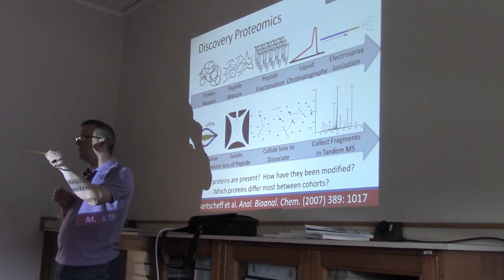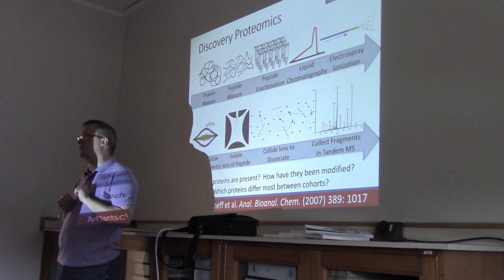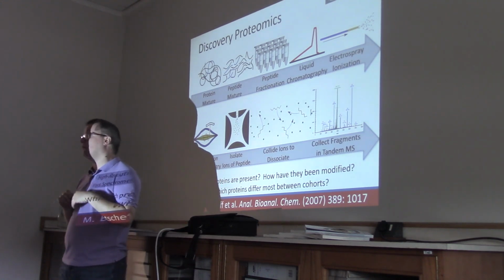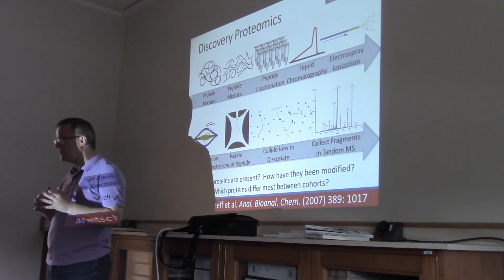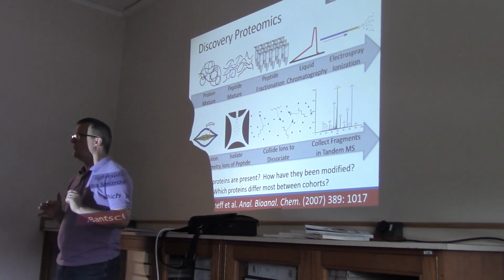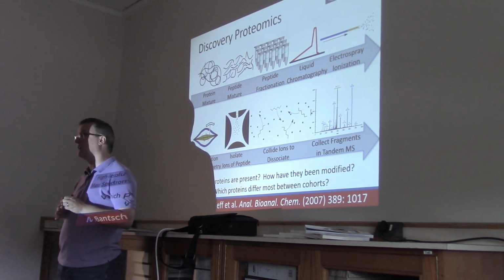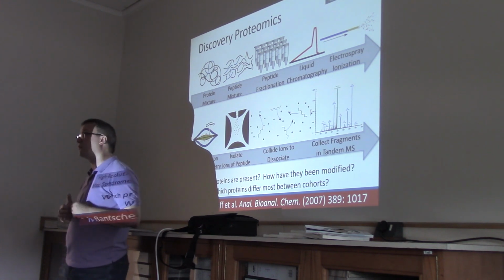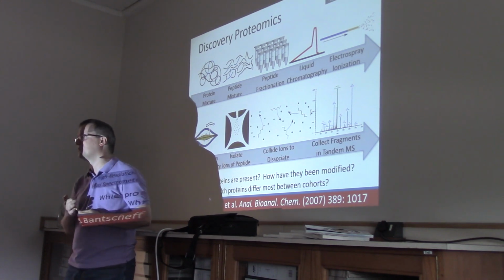Greater than. Anyone disagree? Are there some proteomic samples that would have less than 1,000 proteins? Definitely so. We often use things like co-immunoprecipitations and fire those through the mass specs. Typically, if those are relatively clean at least, they're not going to have 1,000 proteins in them. We may be shooting something very complex like a biofluid through a mass spec, and it will contain more than 1,000 proteins, but we won't see them all because of the dynamic range problems there. Lots of some proteins block the appearance of some smaller proteins.